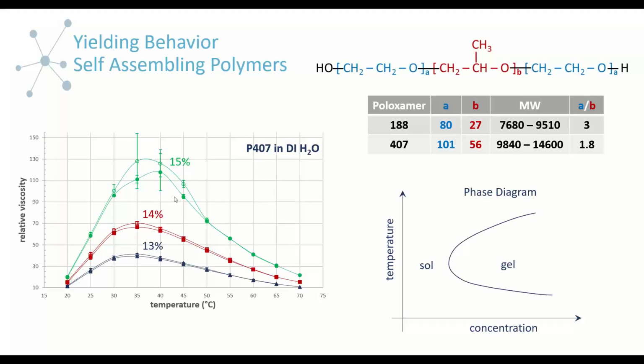So the first sign that something strange is happening is that this is very inconsistent. And although I haven't talked about it too much yet, artifacts typically are inconsistent and give you irreproducible data. That's not always true.